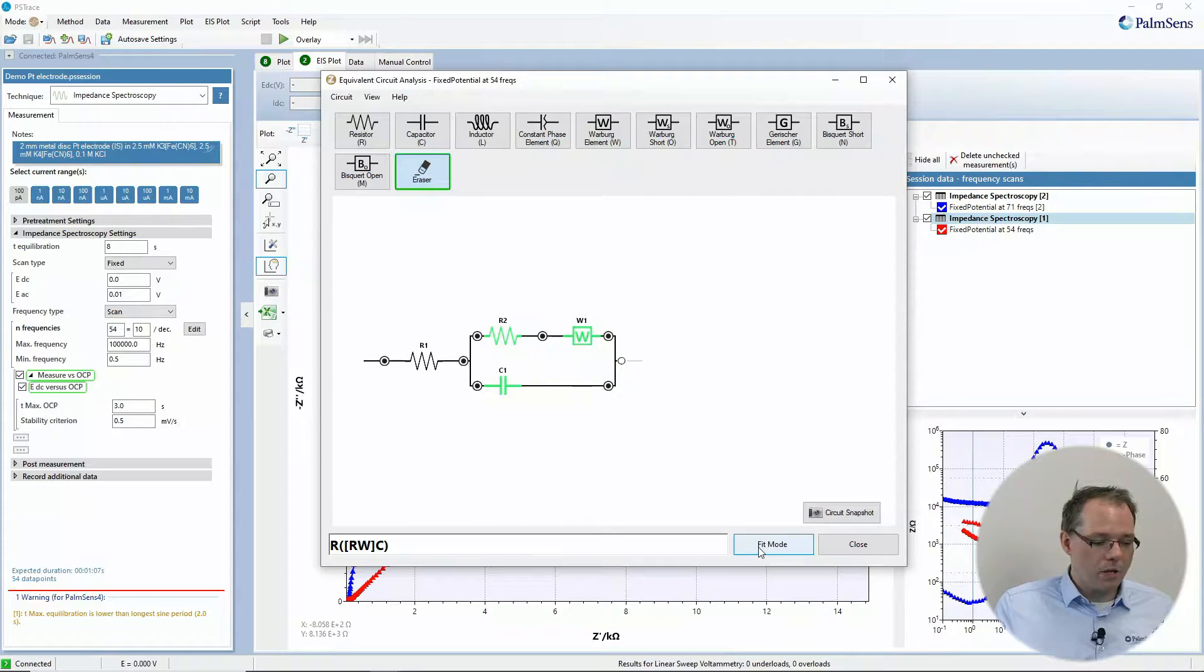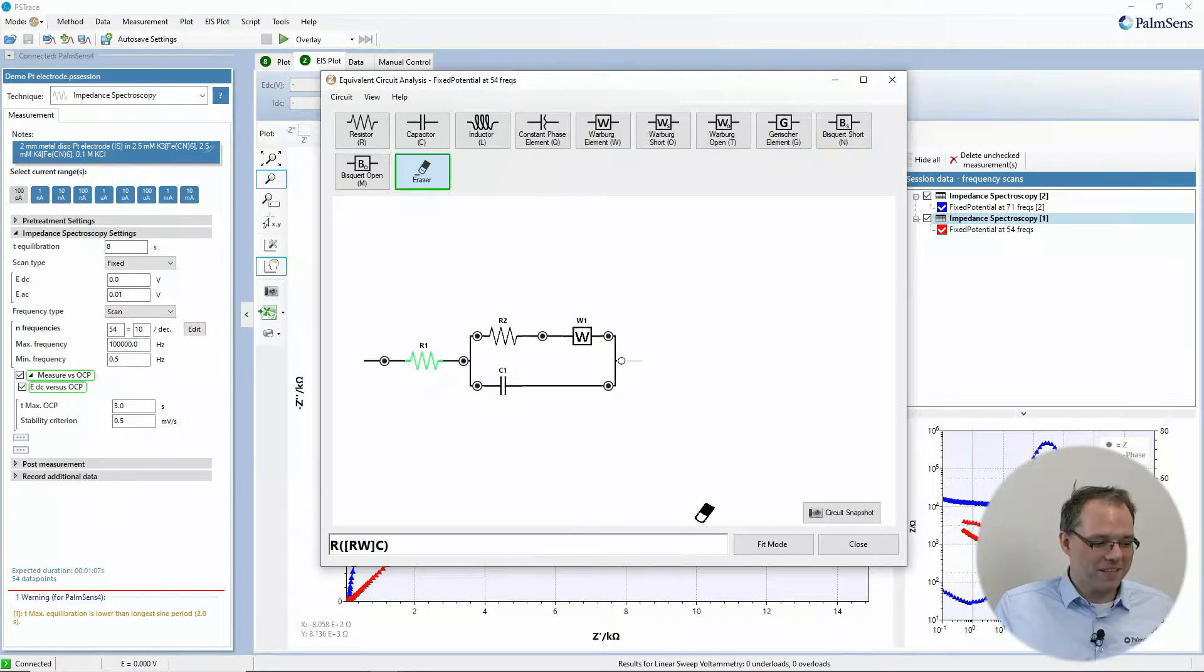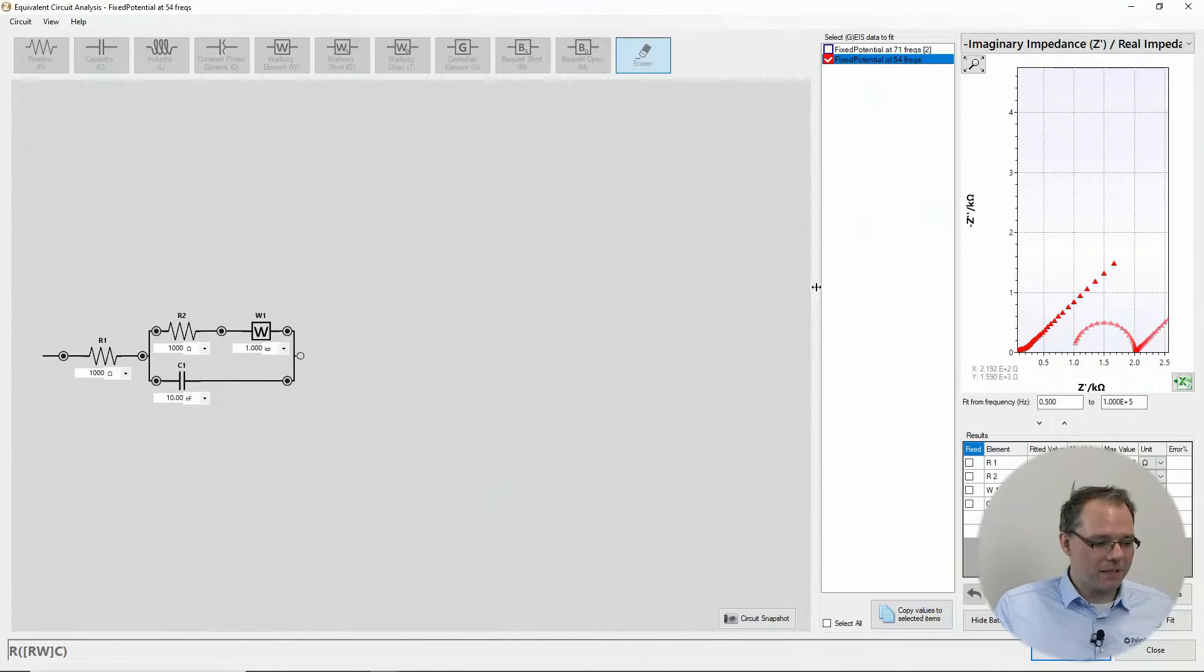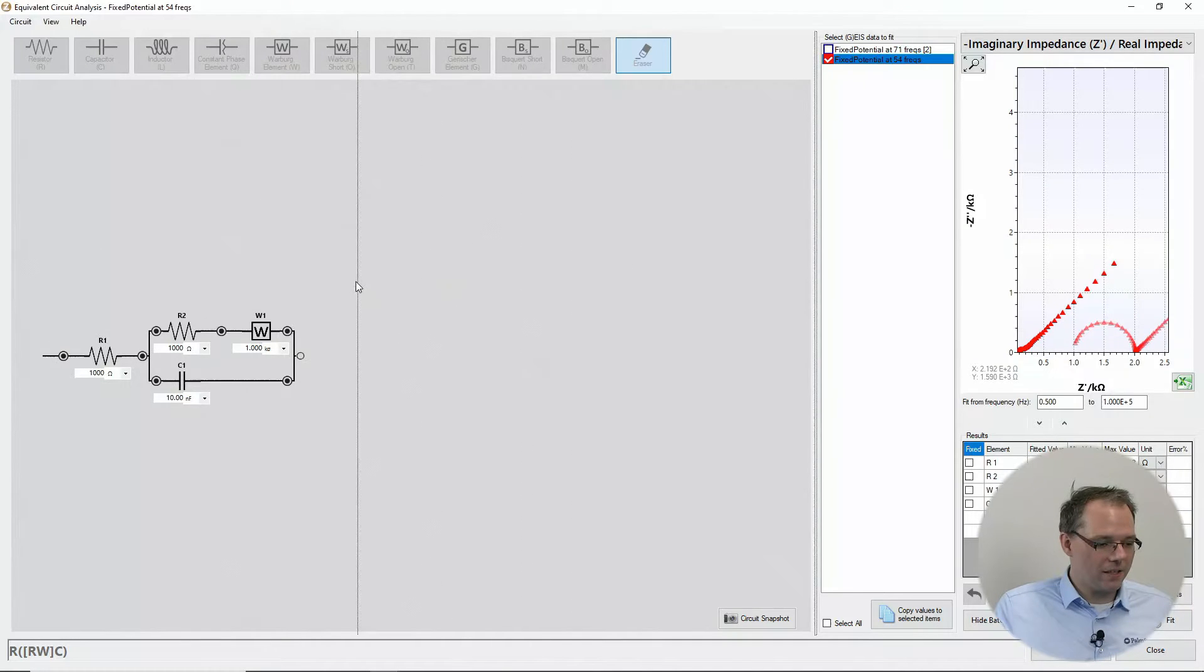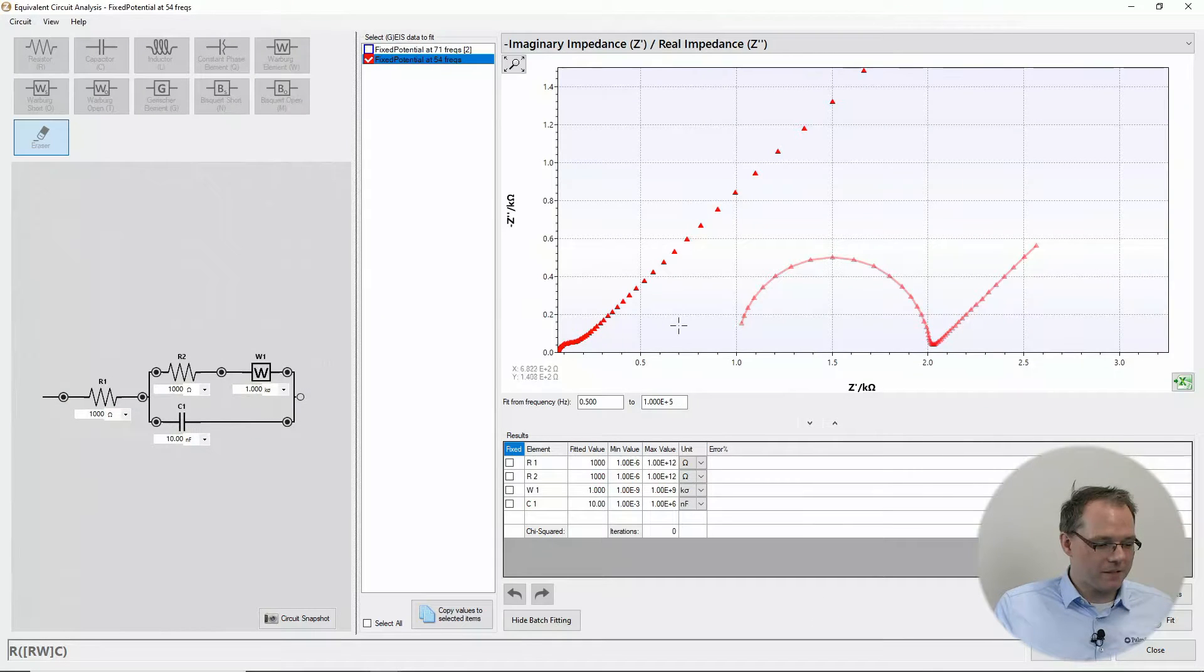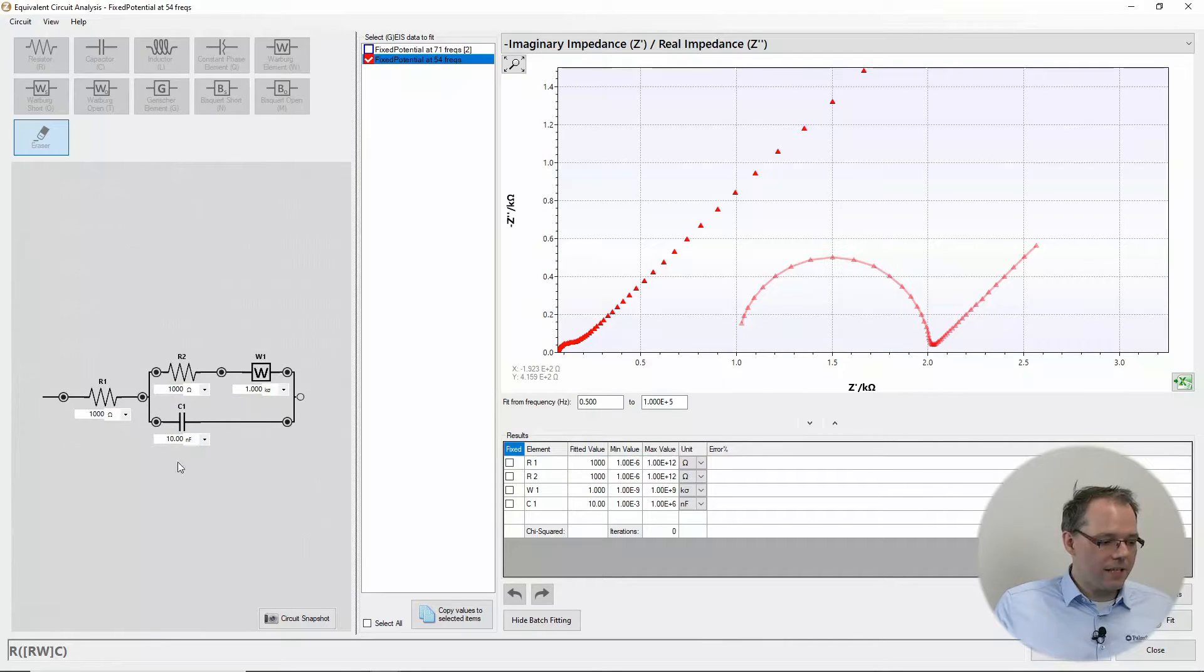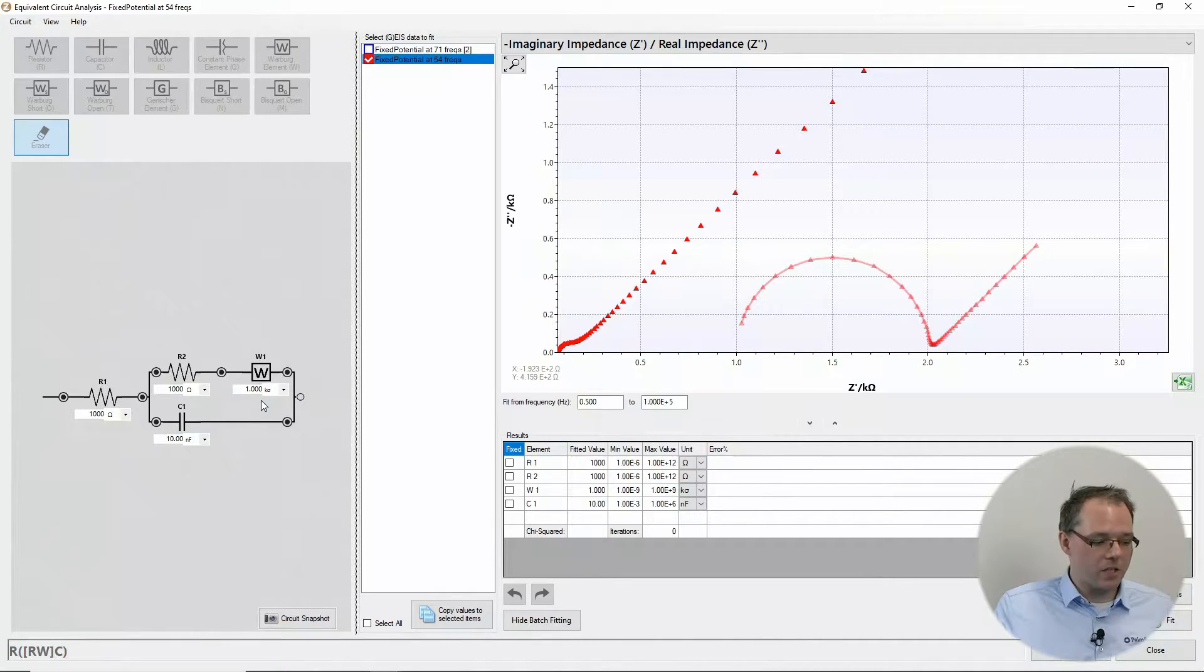And then we can go to fit mode. I'll just make this big so we can nicely see everything. So now you see immediately your circuit with all the starting values at each of the components.